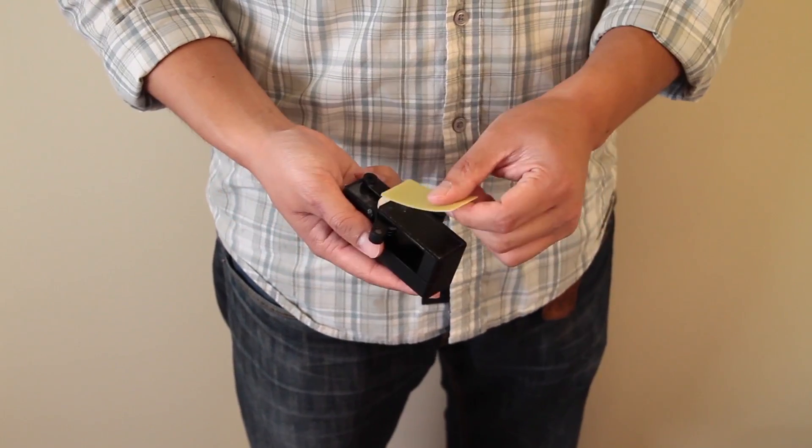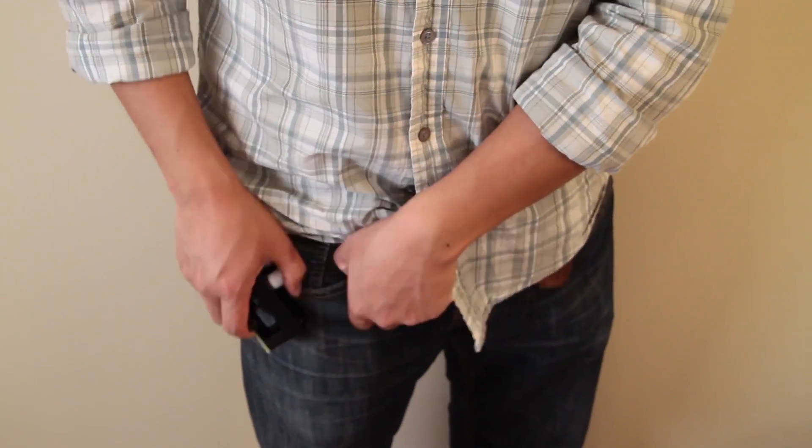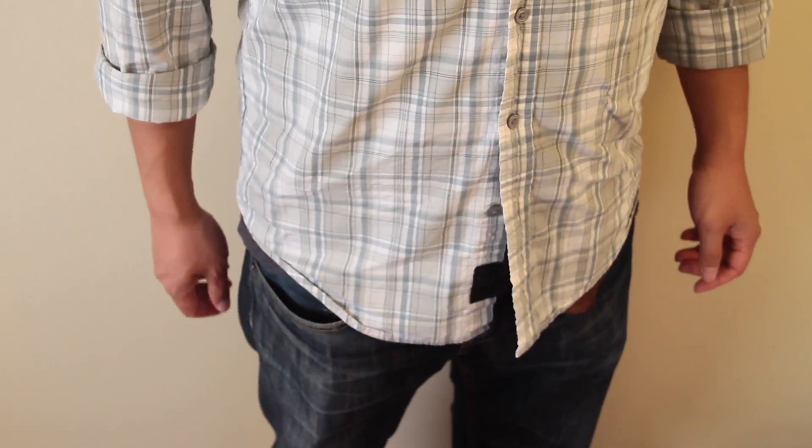And even after everything we put into this, it's still pocketable. This is truly a next generation microscope. So why pledge? Well, if you or your loved ones are tired of trying to explore this world through lectures, books, or the internet, pick this up. The magic isn't in exploring this world through a window — the magic is when you're looking at something right in front of you in a way that you've never experienced before. The simplicity, versatility, and portability of this device enables anyone to explore this micro-universe wherever they may be.